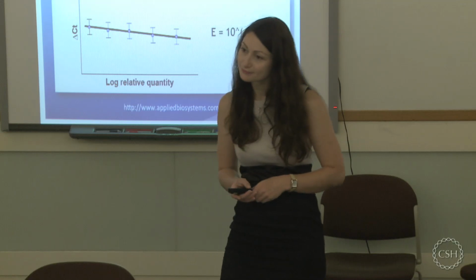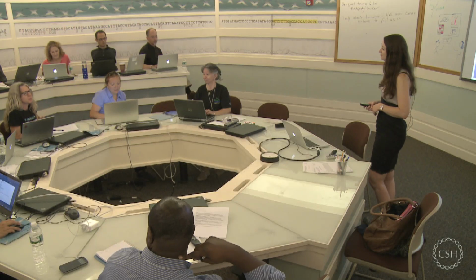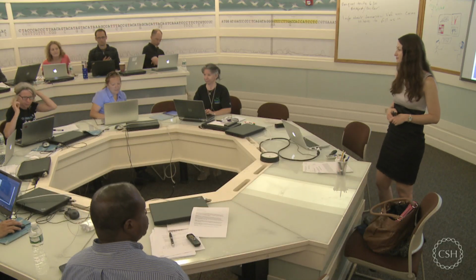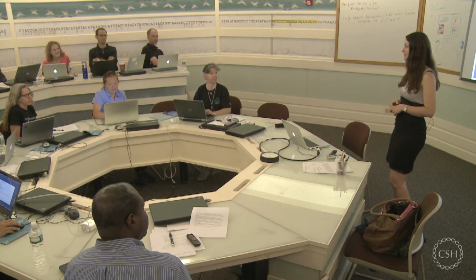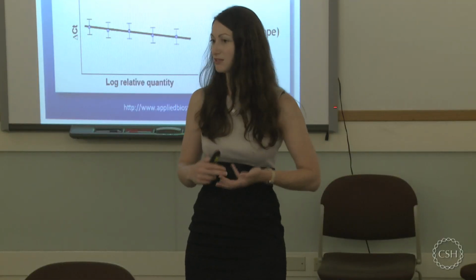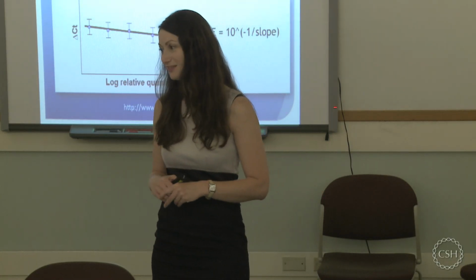The other thing, we've noticed sometimes we'll get primers from a paper and we use them in our lab and we get funny results, and then we go and check these things and they're not optimized. So just don't trust it just because it's in a paper. It doesn't mean they optimized it. And you could also use slightly different conditions or slightly different reagents, so just be really careful. That's a very good point. I actually stopped using any primers from any publications because they never worked for me. I always get triple bands. And it can, of course, depend on different buffer systems, different qPCR machines, different people pipetting, I don't know.